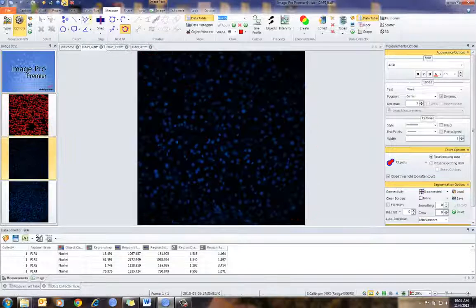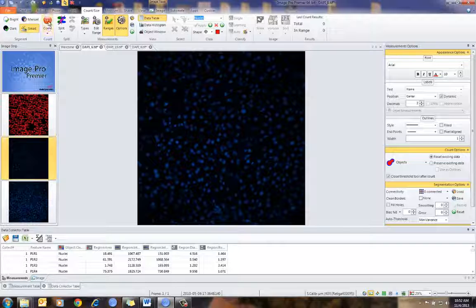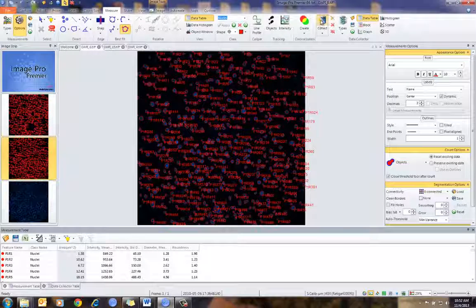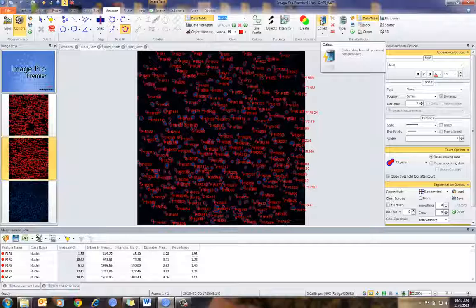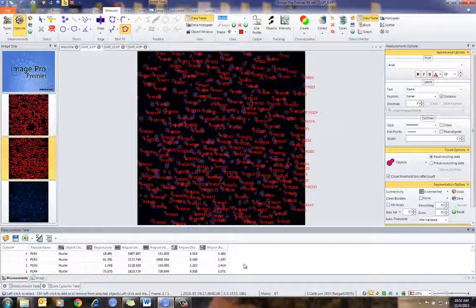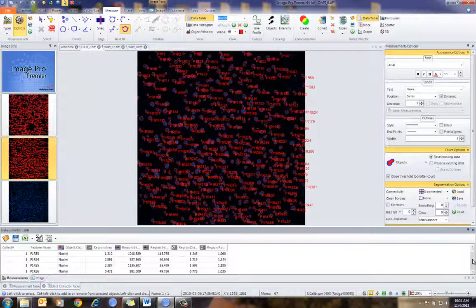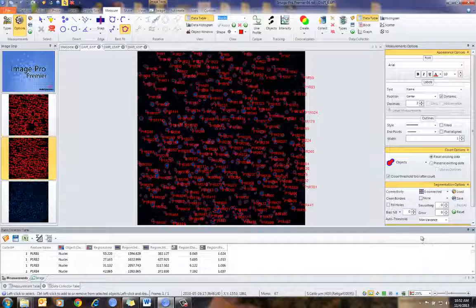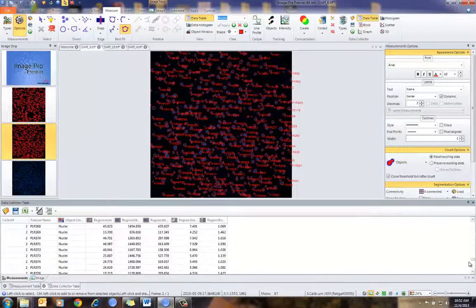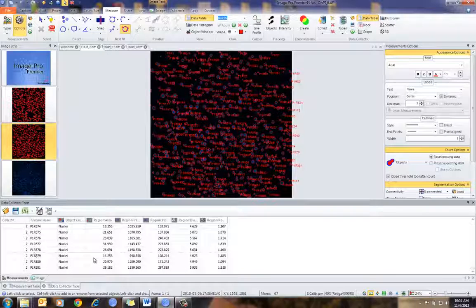I can go to my next image, again count it, then go into my Measure tab and collect the data again. And you'll notice, as I do this, in the Data Collector it's showing me my first collection. As I scroll down, you'll see I've collected data from a second image.